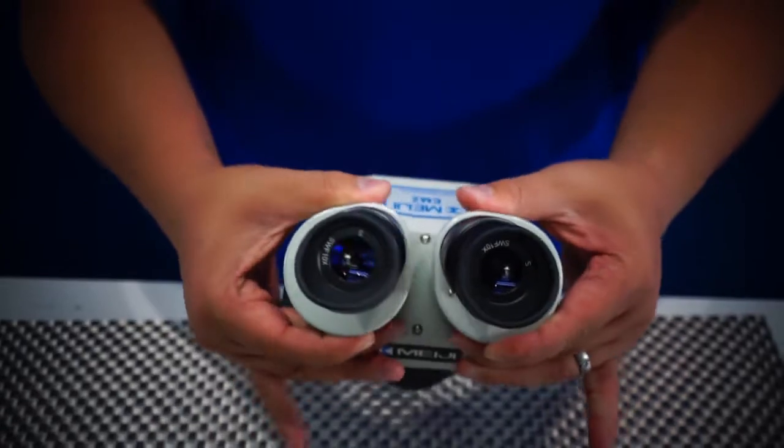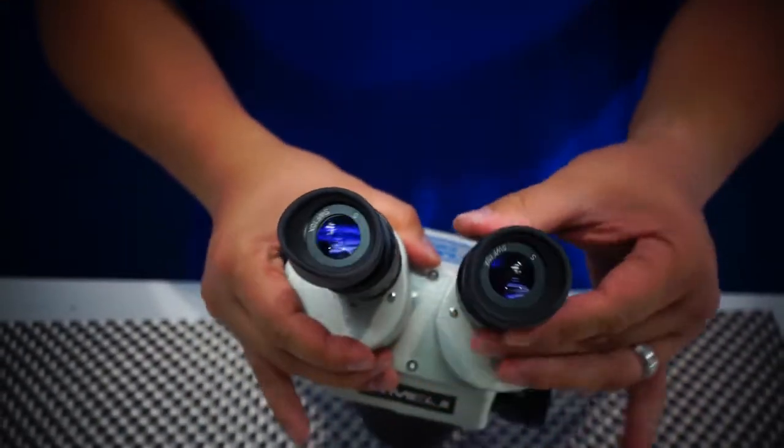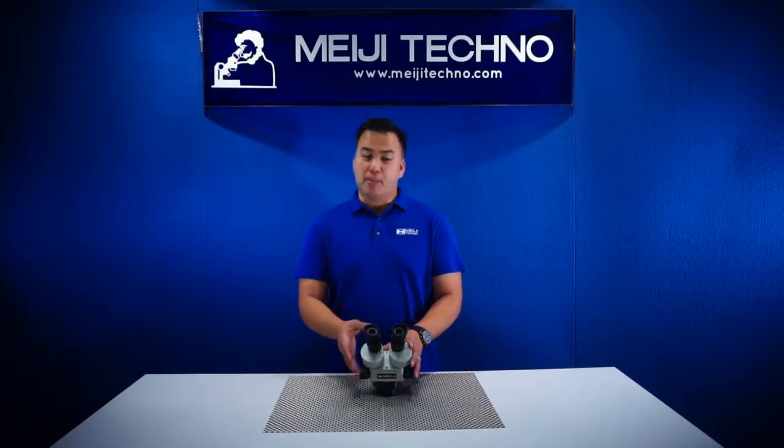With its dual diopter adjustment, the EMZ5 allows the specimen view to not only remain in focus throughout the entire zoom range, but the subject is in focus and par-focal, which saves time because no adjustments are necessary to change the microscope height.